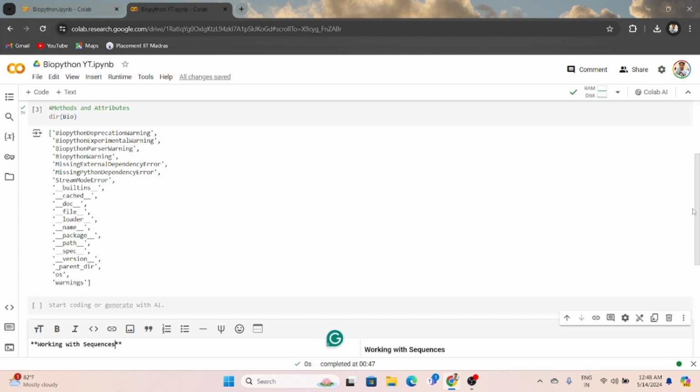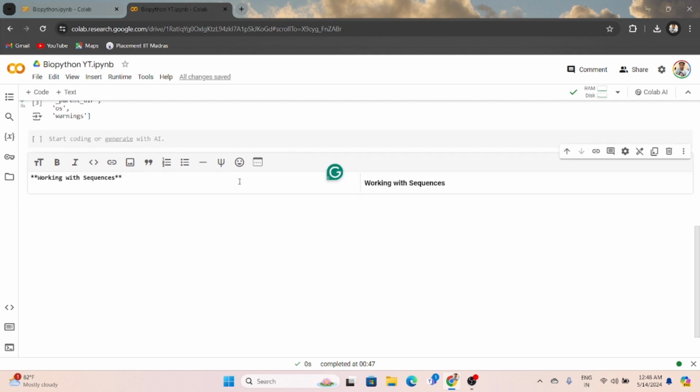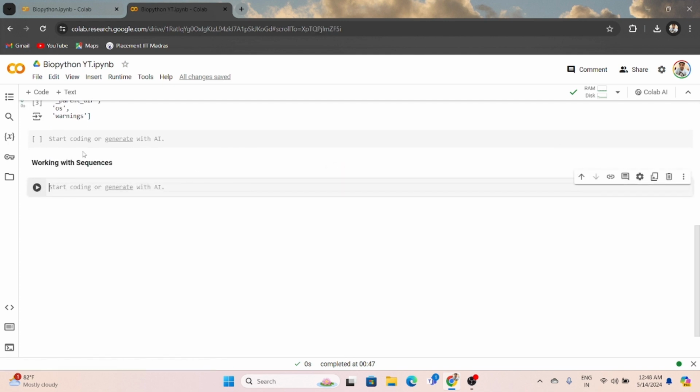This is done. From here I put a heading, so whatever code we write from here will be the code of how to work with sequences.